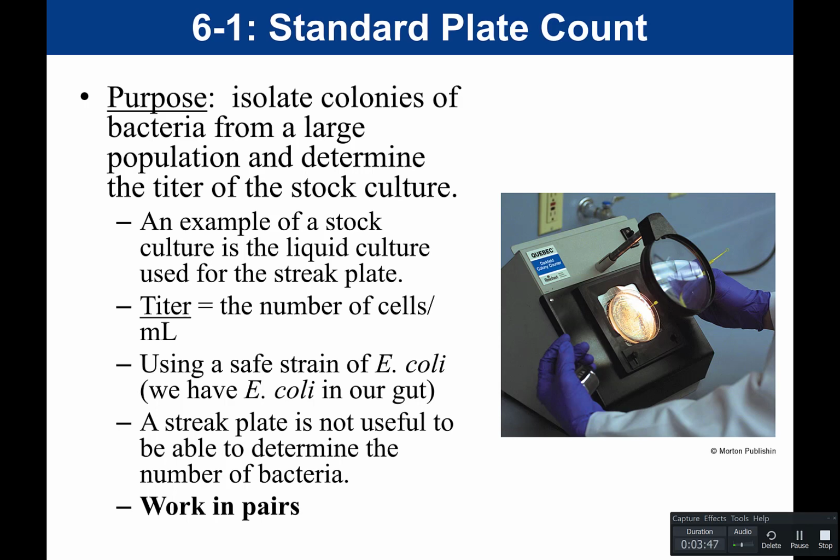A streak plate is not useful to determine the number of bacteria. And so that's what we just talked about. So we can't do a standard streak plate if we want to quantitate the amount of bacteria. Yes, a streak plate can be used for isolation, but we can't determine the titer using a streak plate. We have to use a standard plate count. When you would do this experiment in the lab, this would be done in pairs. You and your partner would do this experiment together.